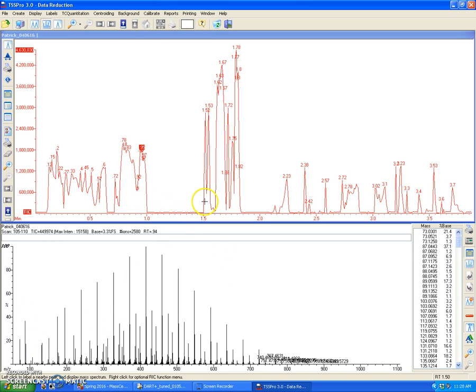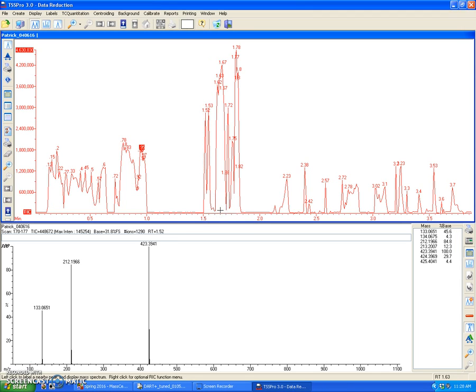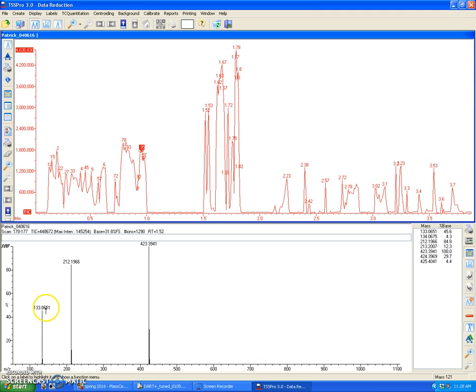So this region right here was where I analyzed a cinnamon altoid, so I'm going to average that, and I can view this mass spectrum that has been calibrated.